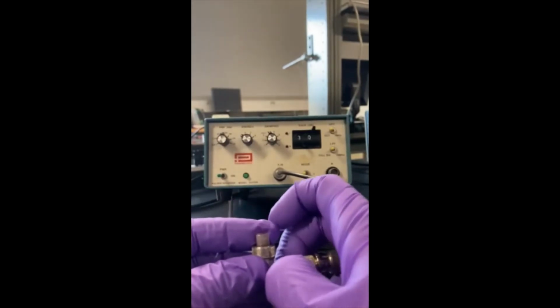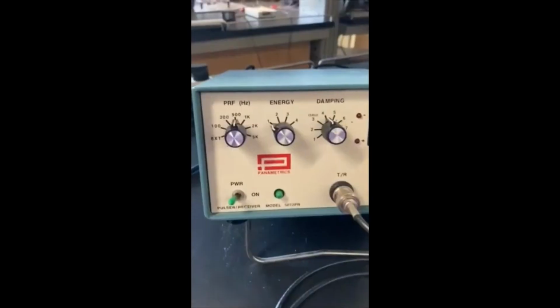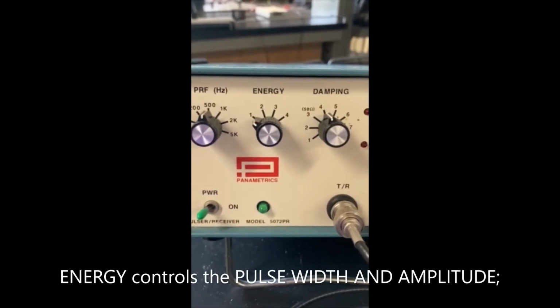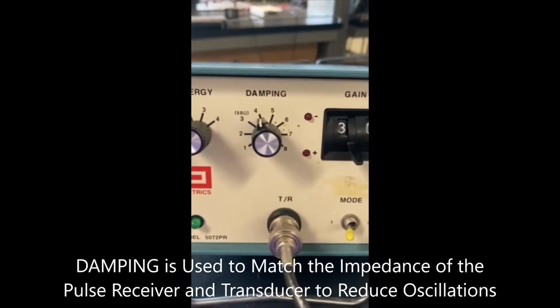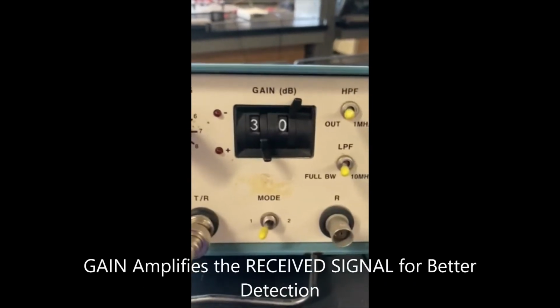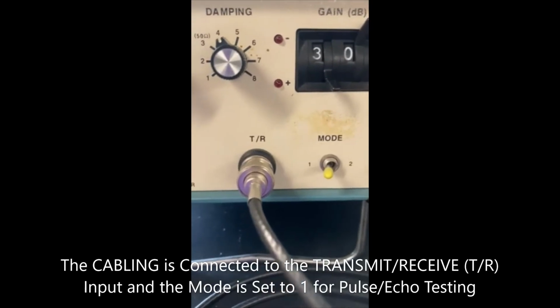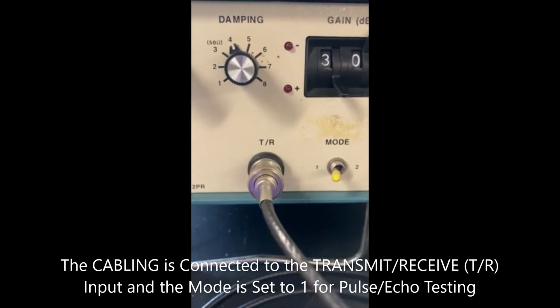We're using that high-frequency tapping, in this case at 500 Hertz, as a pulse frequency to cause the crystal to change length back and forth, creating essentially a high-speed hammer that's going to tap on the sample. That's how the acoustic pulses are created. We refer to them as acoustic pulses because the frequency of 500 Hertz lies in the range of frequency that a typical human is able to hear. The typical human can hear between about 100 Hertz and about 18,000 Hertz.